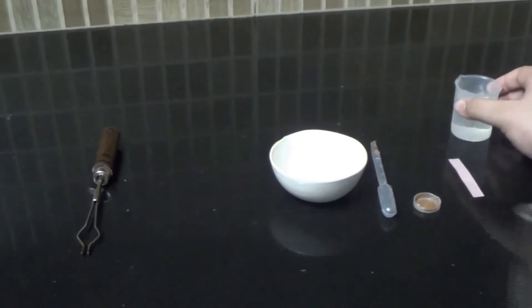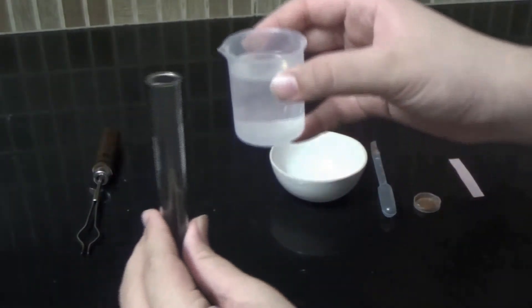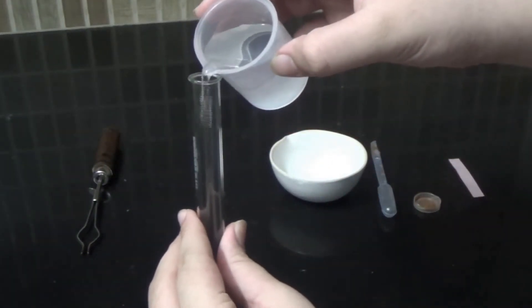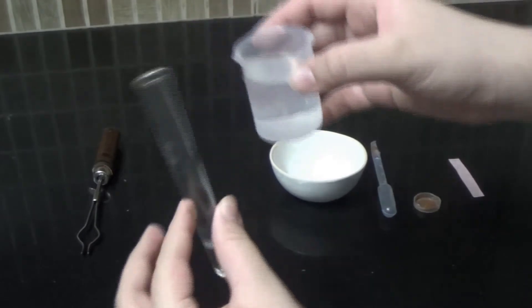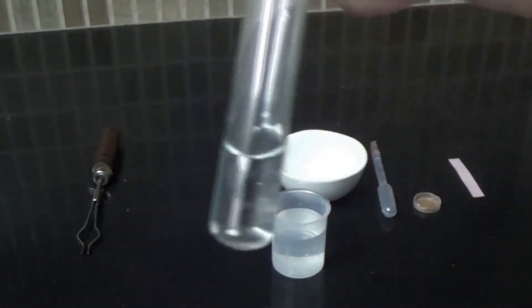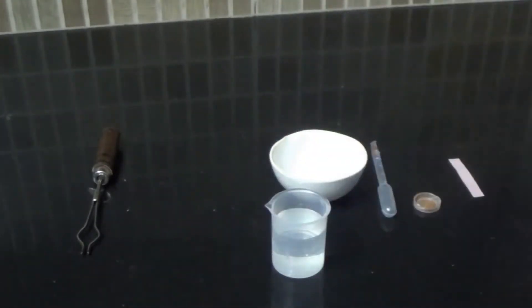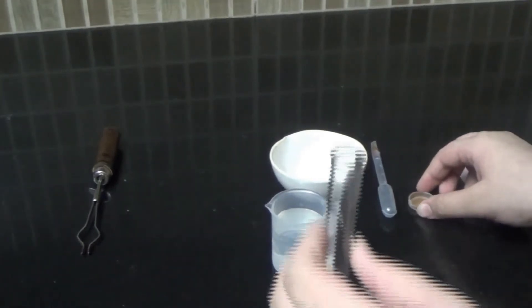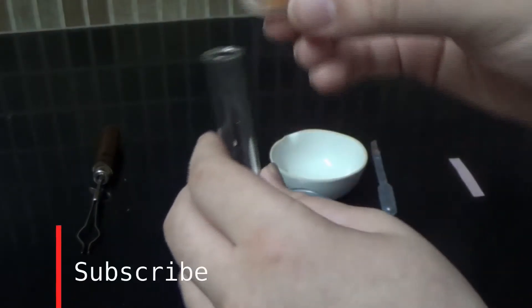Take the test tube and add water to it. Now add some rust to the same test tube and mix it thoroughly.